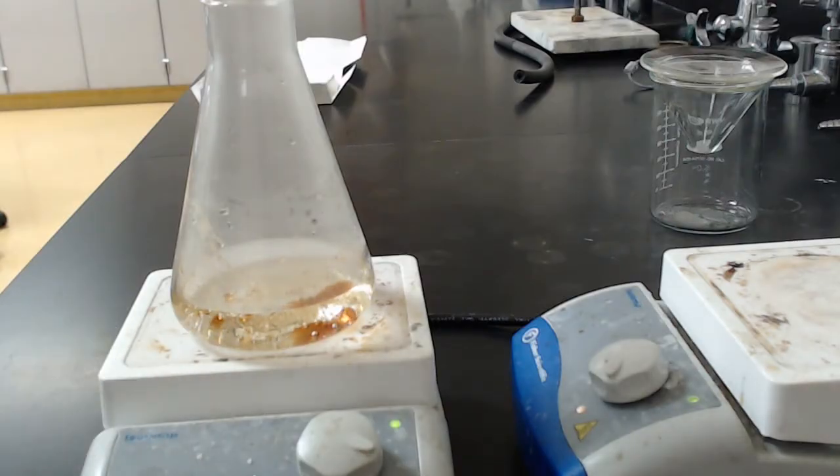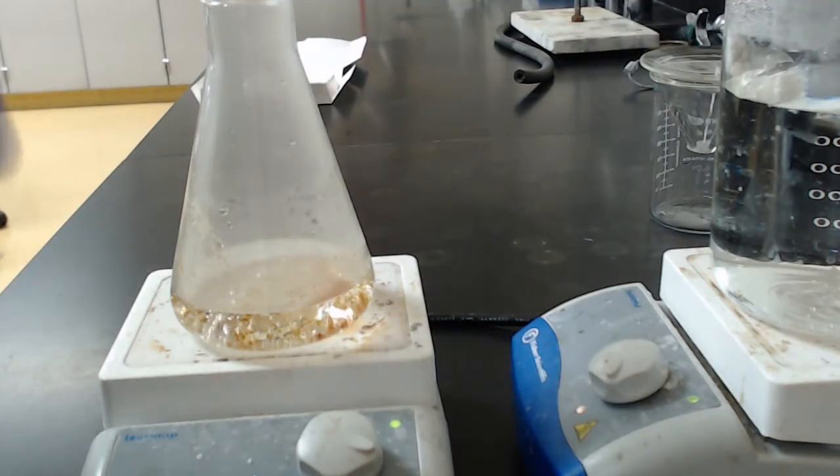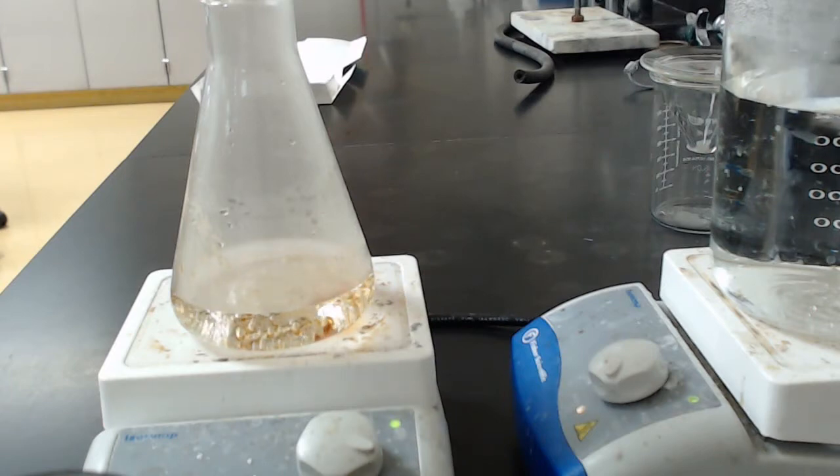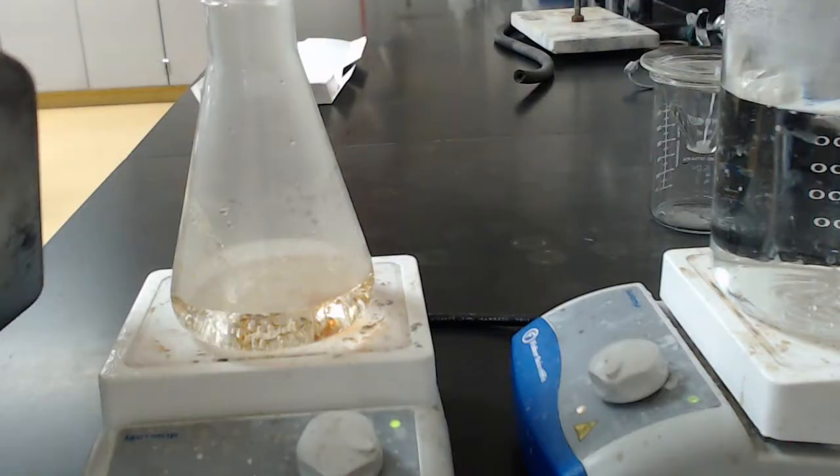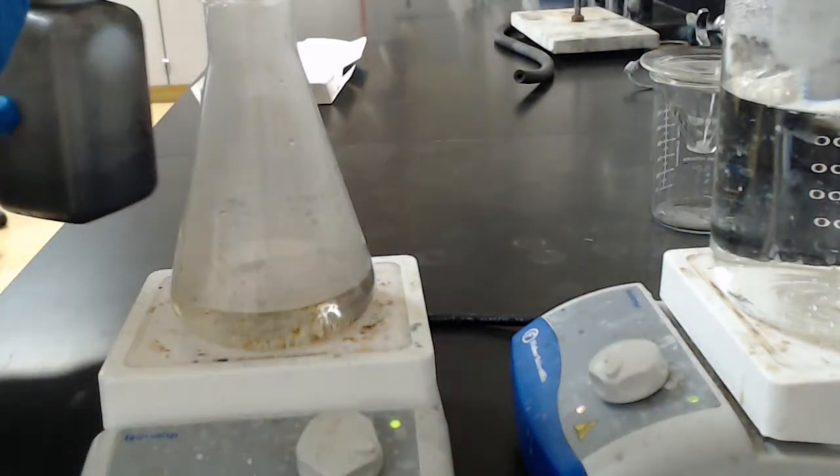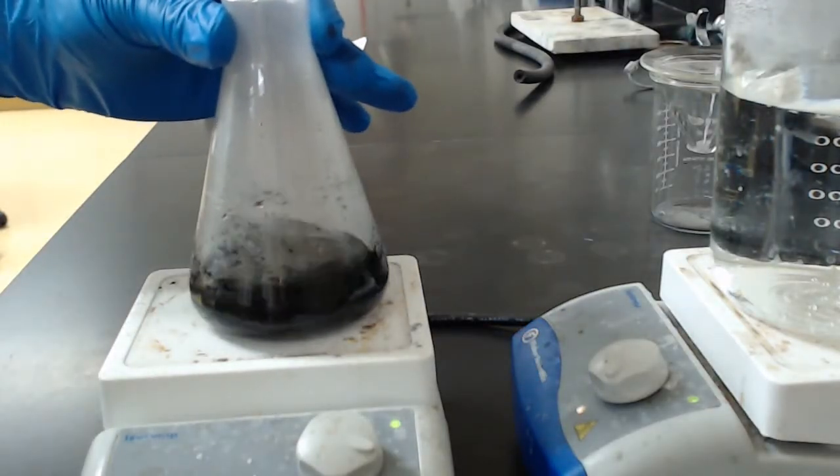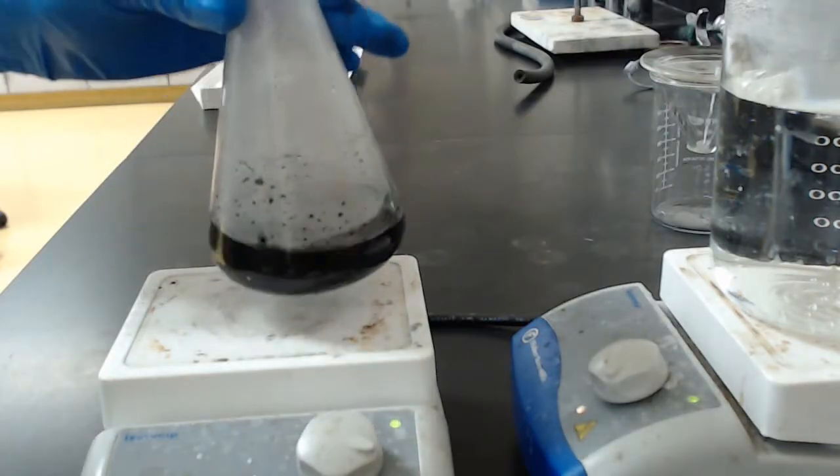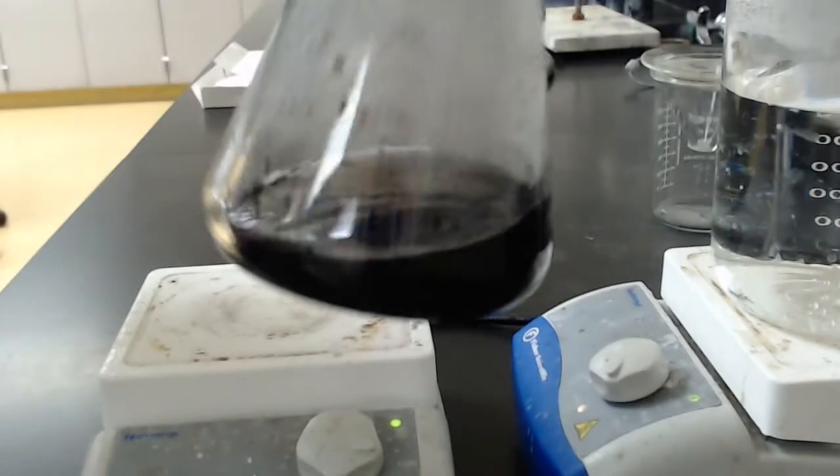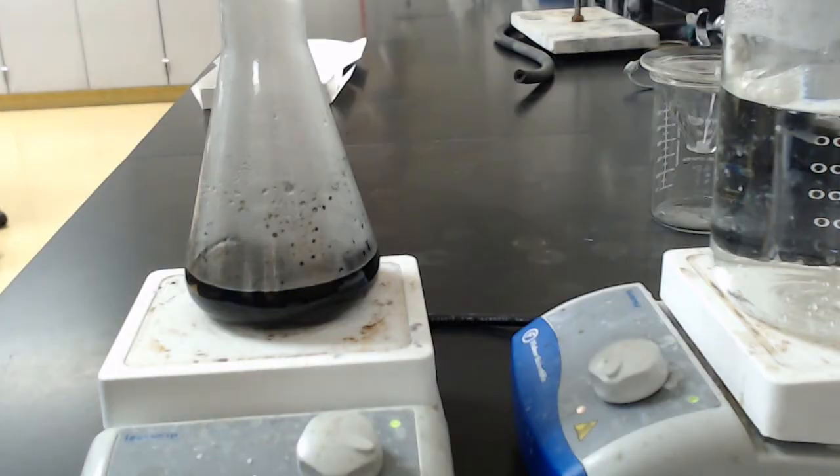So the best way to get rid of this kind of stuff is to add some activated charcoal to the mixture. And this part, you want to be careful that you don't add it too fast, otherwise it's going to boil over on you. All right. So let's go ahead and add a little bit of charcoal in there. Hopefully I don't add it too fast. And you should see the brown color almost go away. We're going to keep the black there because, you know, charcoal is not soluble in water. But you should look for the brown color to go away. I know it might be challenging to see. But I don't see any brown in there anymore. This is black. I think I have enough charcoal.